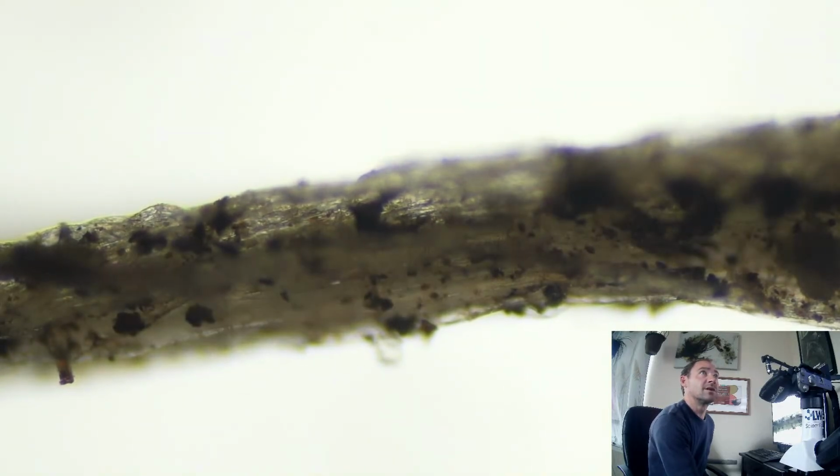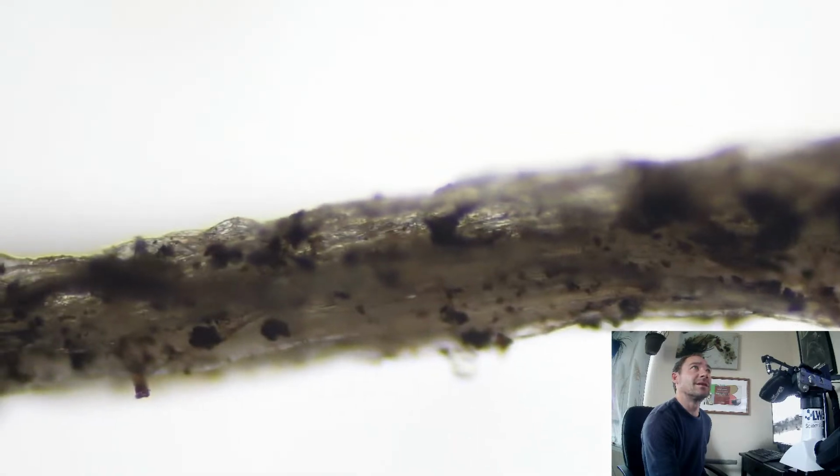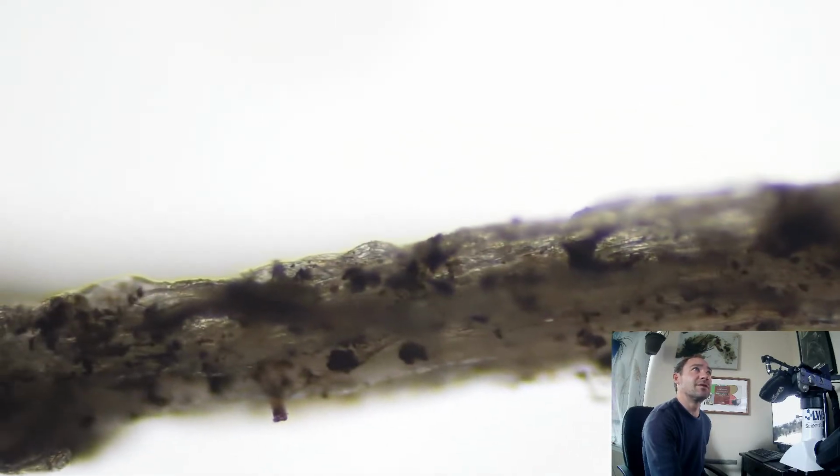Kind of adjust our, yeah, somewhere right about there. We can kind of see through it. So just to give you guys an example of what the Epi can do compared to just bright field, you really can't see any of that glow. And this is a pretty thin root. A lot of times it's hard to even see through the root. A lot of times it just shows up black.